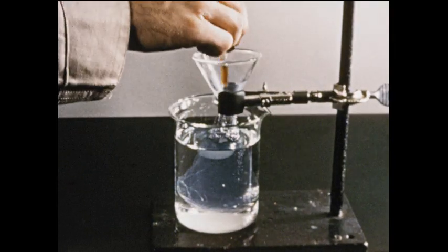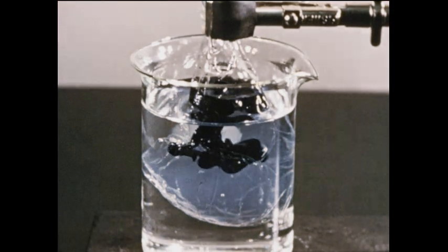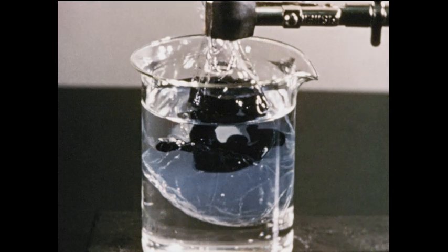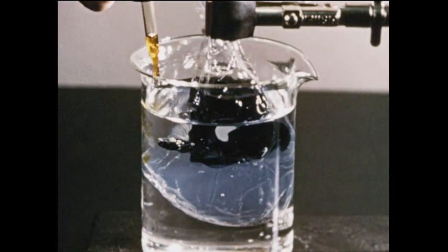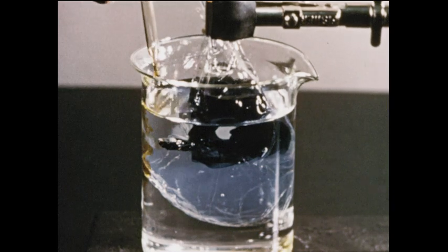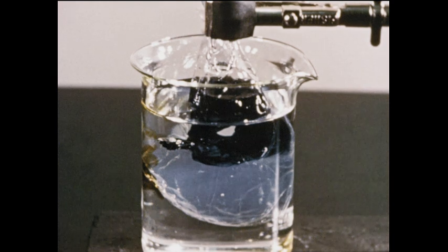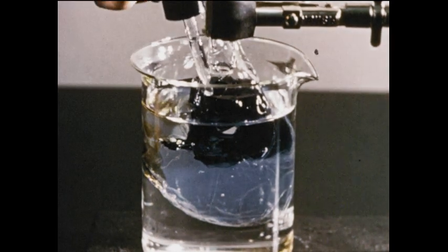When iodine, a reagent used to test for starch, is added to the bag, it turns blue, showing that starch is still in the bag. Iodine in the surrounding water shows no blue reaction, so starch didn't pass through the membrane. Silver nitrate is a reagent used to test for the chloride ion of salt.